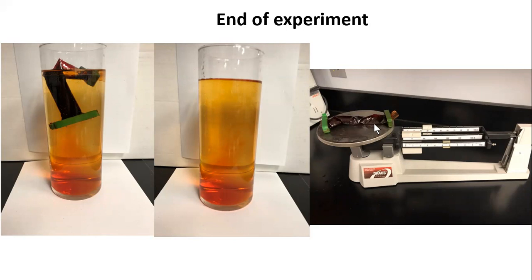And so for point B in your lab report, the last item is we demonstrated osmosis because water entered the dialysis bag, and we could demonstrate increased weight of the dialysis bag. So that is our way of confirming that osmosis indeed occurred as we would expect it.